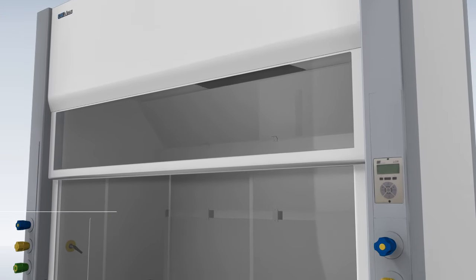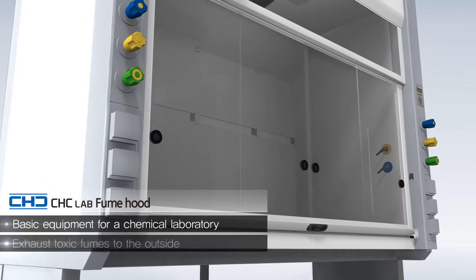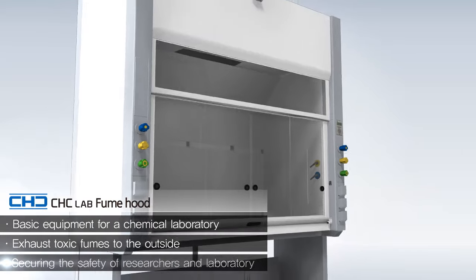Fume hood is a type of local ventilation device that is designed to exhaust toxic fumes, vapor or dust to secure the safety of laboratory workers.